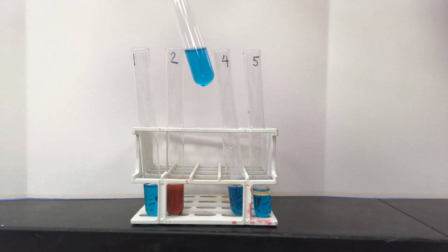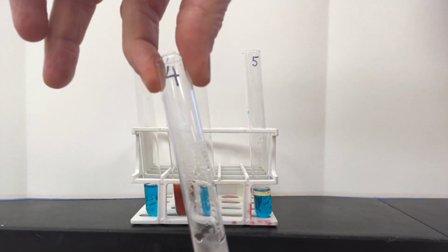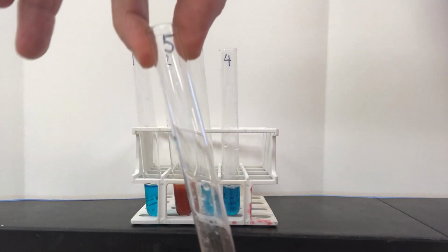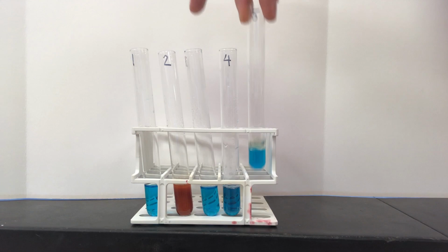This makes sense, as test tube number 2 has fructose in it, which is a simple sugar, and should respond positively to the Benedict's test. Therefore, fructose could be used as our positive control. None of the other samples changed because none of them contained a monosaccharide.